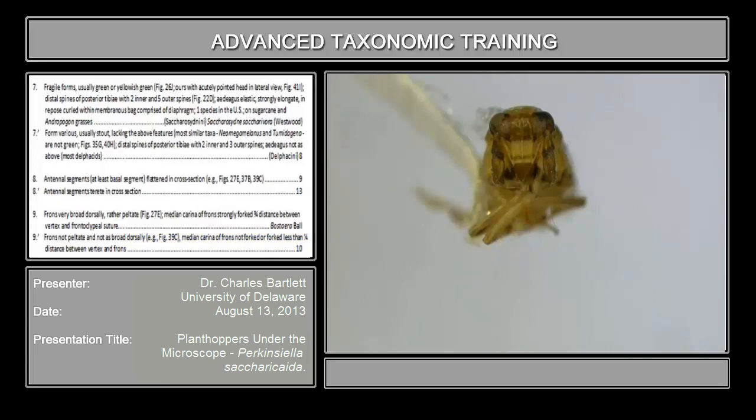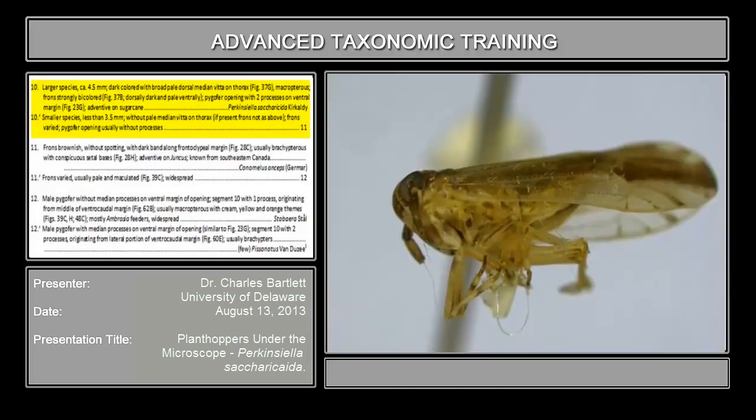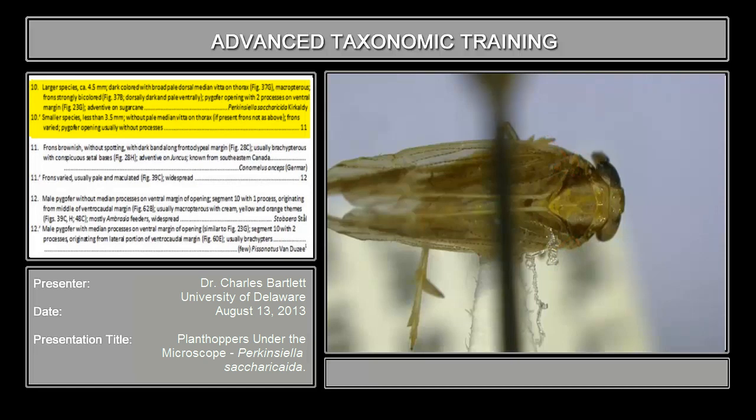Couplet 10 reads: larger species, four and a half millimeters. If you look at this specimen — or this female in this case — and had a way of measuring it, you would discover that this specimen does indeed exceed four millimeters. Dark colored with broad pale dorsal median vitta. You can see right here it is broadly pale medially and dark laterally. So far this seems to work.